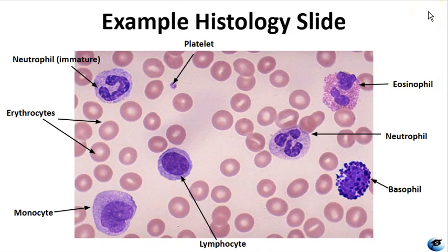As you examine the stained blood smears, your main goal is to identify the formed elements with all of the visual features. This is a beautiful figure giving a good example of almost everything that you might see. See these erythrocytes with no nucleus and they're concave on both sides. There is the lymphocyte with a really, really big nucleus and very small amount of cytoplasm around it. You can see which of the leukocytes are agranular versus here's a basophil that has very, very dark purple granules. Here we have granules, but they're a lighter pink color.